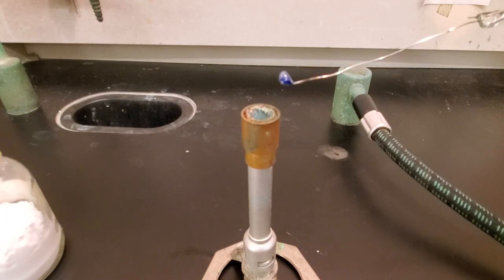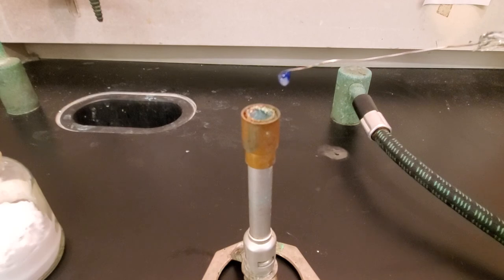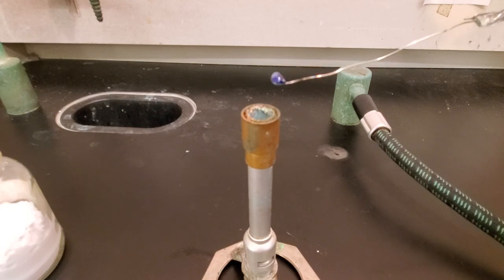So again, the borax bead test — it's good if your substance has a color. Use it as a confirming test for those substances. If your substance is colorless, is white, or makes a colorless solution, you probably don't need to do the borax bead test. Pretty easy test to do.